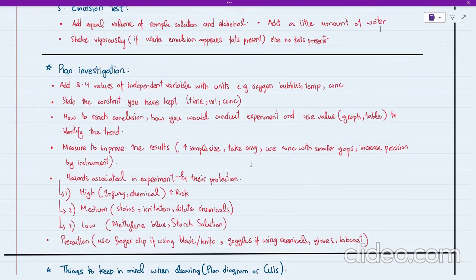For example, if we are assessing the concentration of glucose in different solutions after performing the dilution, they are asking us to describe the modification that you would perform in order to have a better result for the solutions which have the highest concentration. So how do we do that?